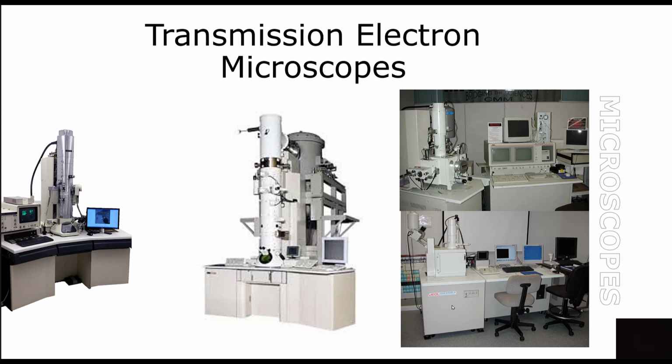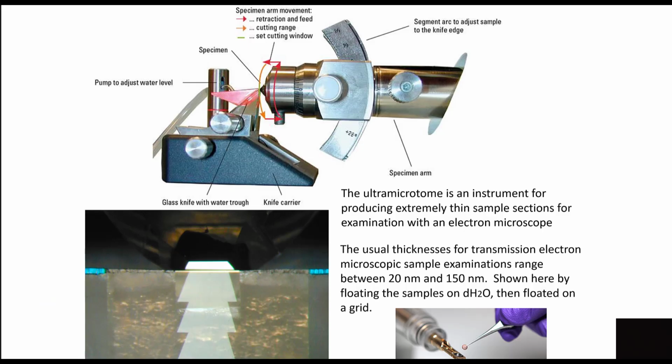The JEOL is a really nice one, but they tend to be about $1 million, and they can go on up to $4 or $5 million, depending on how good of an experience that you want.